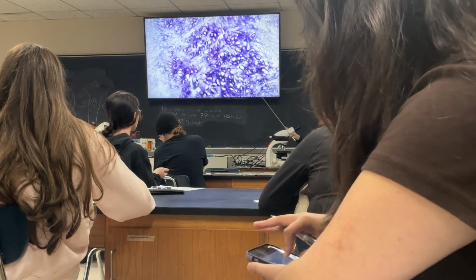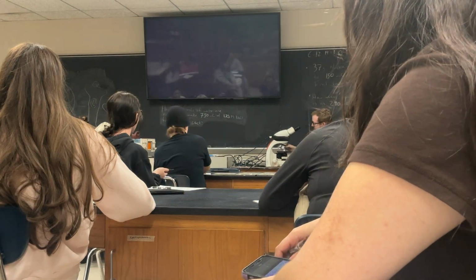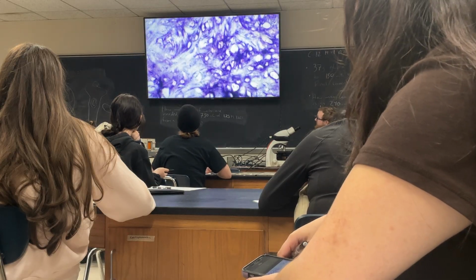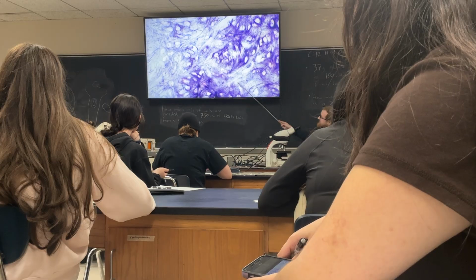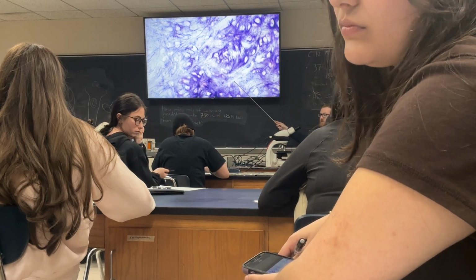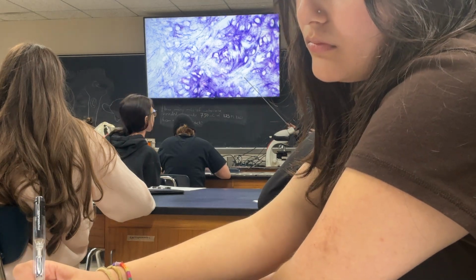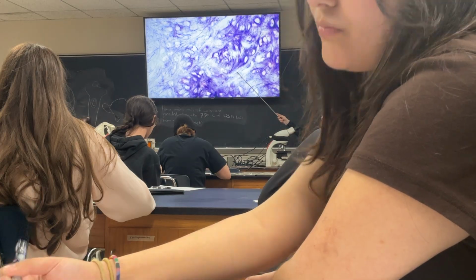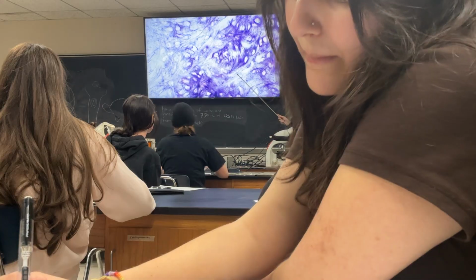Because what you're looking at with all this dark purple, and especially down here, I can zoom in a little bit more. Actually, I can zoom in quite a bit more. So that was pretty zoomed out. This still isn't even my highest magnification. But I can see these individual protein fibers, right? Hyaline cartilage, you're not going to see protein fibers. It's going to be an amorphous ground substance, which means it's all going to be generally one color. I can pick out individual proteins. That makes this elastic cartilage. Those are elastic fibers in between.